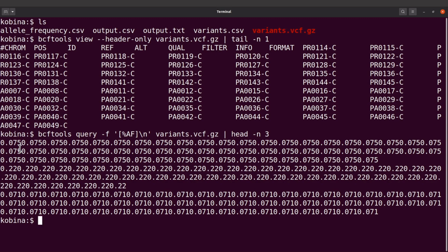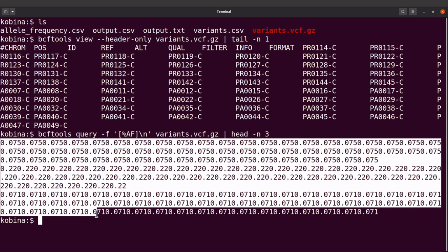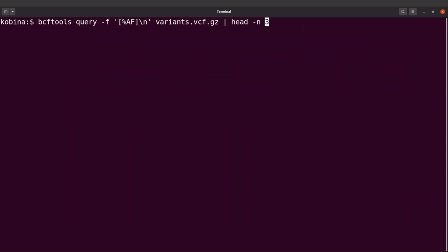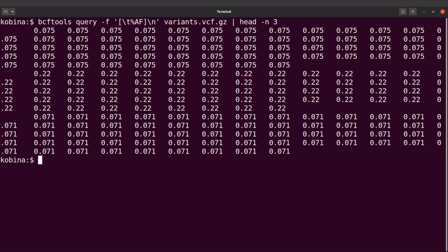But you will notice that the values here are all bundled up, so it can be quite confusing. So we can add a separator. Let's add \t as a separator to properly format it. So now you have it done nicely for us. That's how we do it.